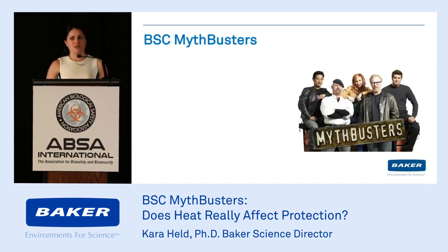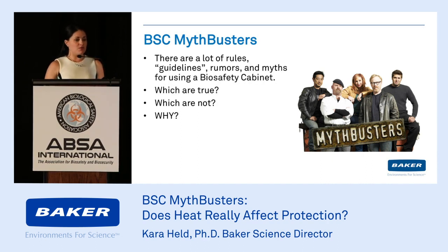So if you're familiar with the show, you know that these guys, who we're not affiliated with, find myths and test them out, theoretically and then practically, and try to solve them. So we're going to do the same thing, but with biosafety cabinets. There are a lot of rules, guidelines, rumors, even myths about how to use a biosafety cabinet. So we're going to determine which ones are true, which ones are not, and more importantly, why.